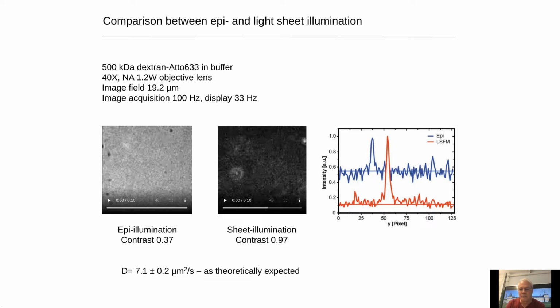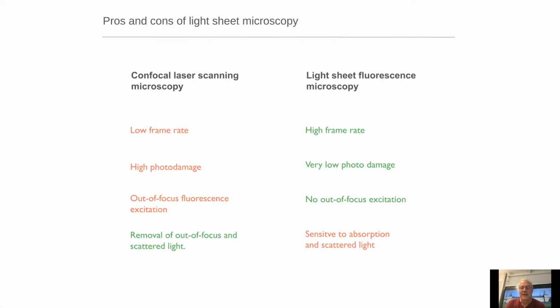If we compare this technique with confocal laser scanning microscopy, for example, as shown on the left-hand side, we see that confocal microscopy provides low frame rates only.